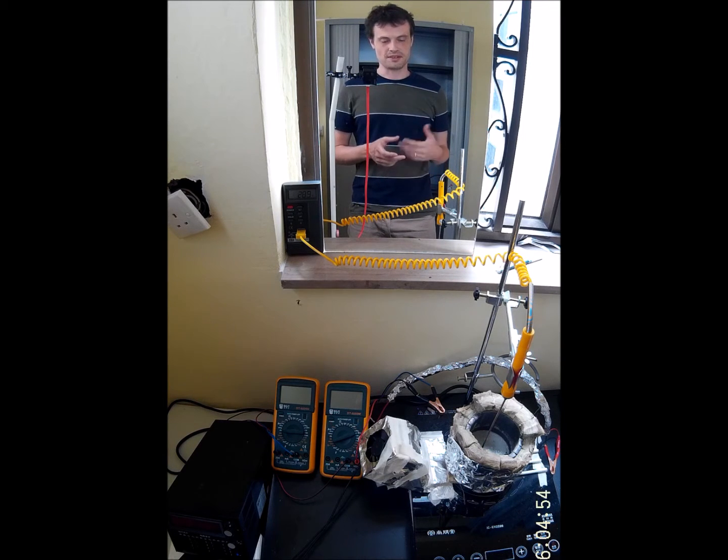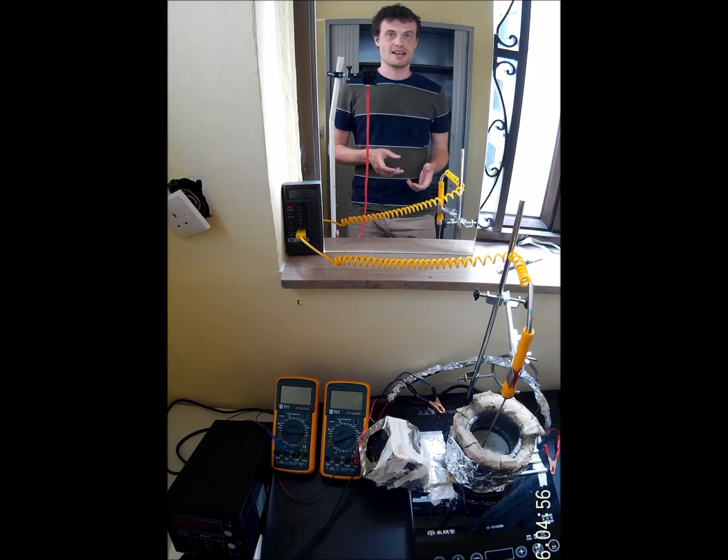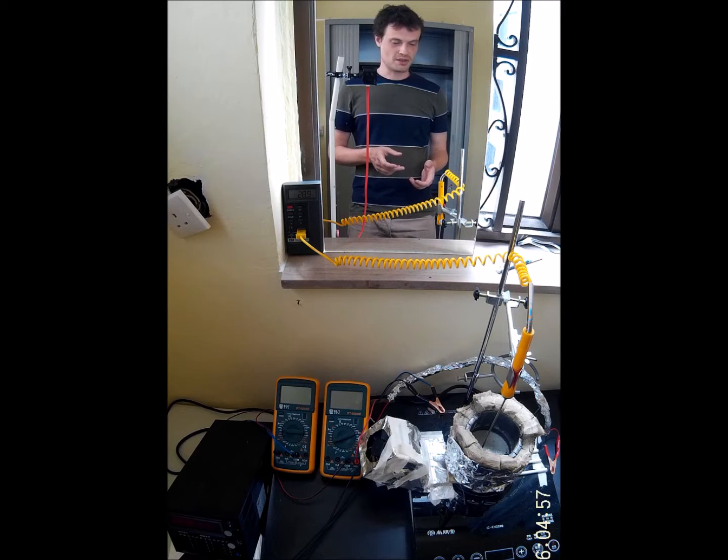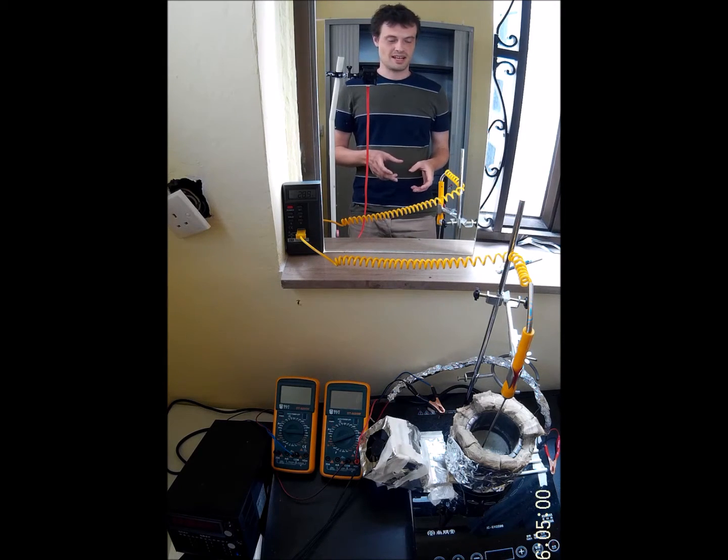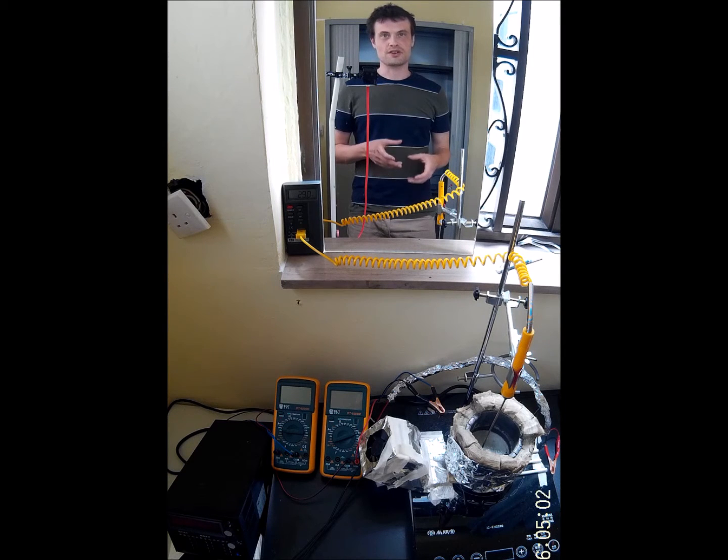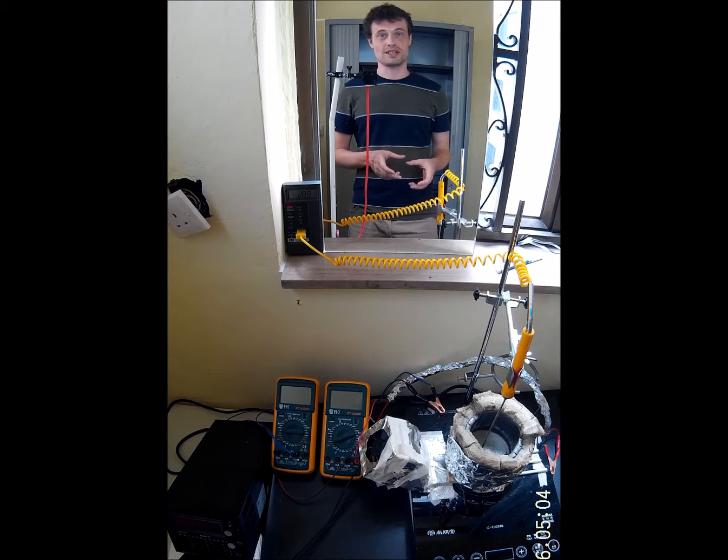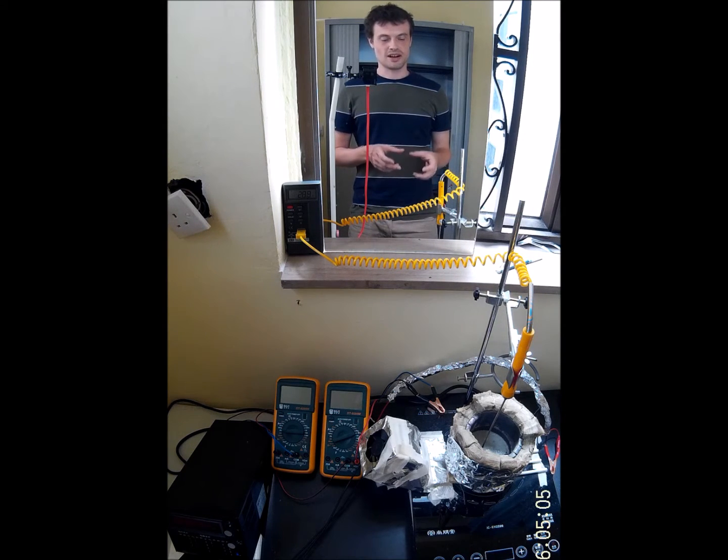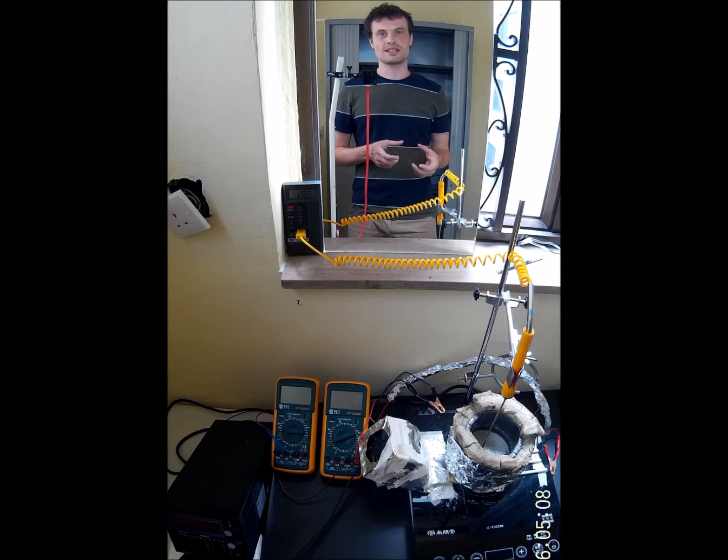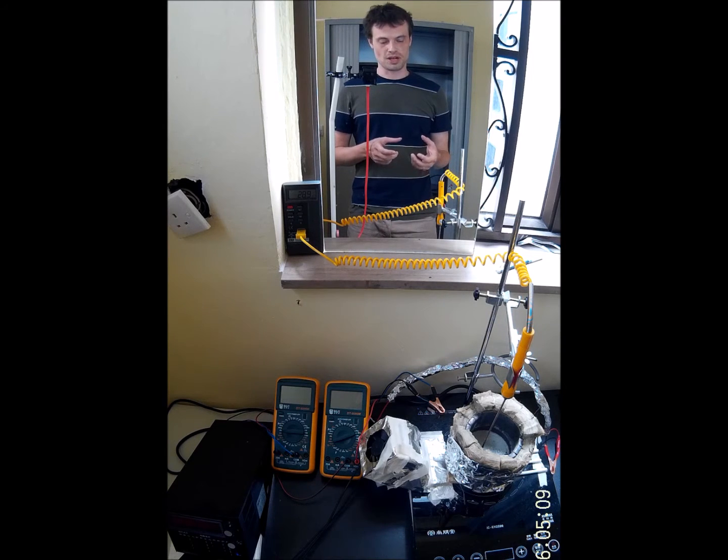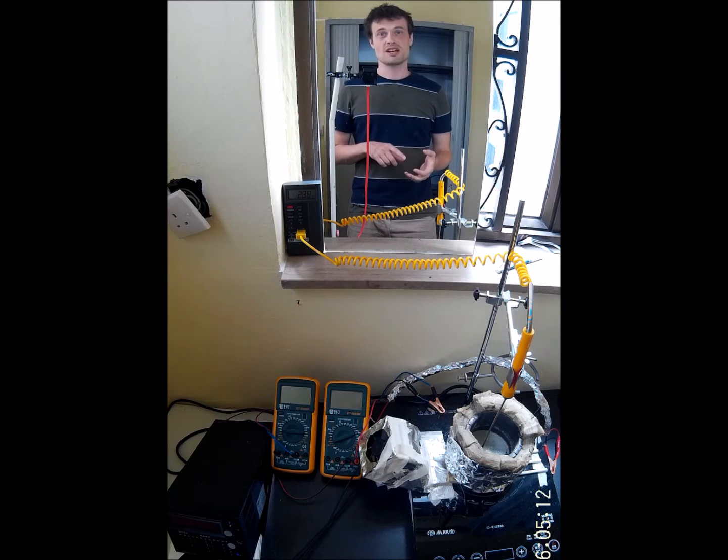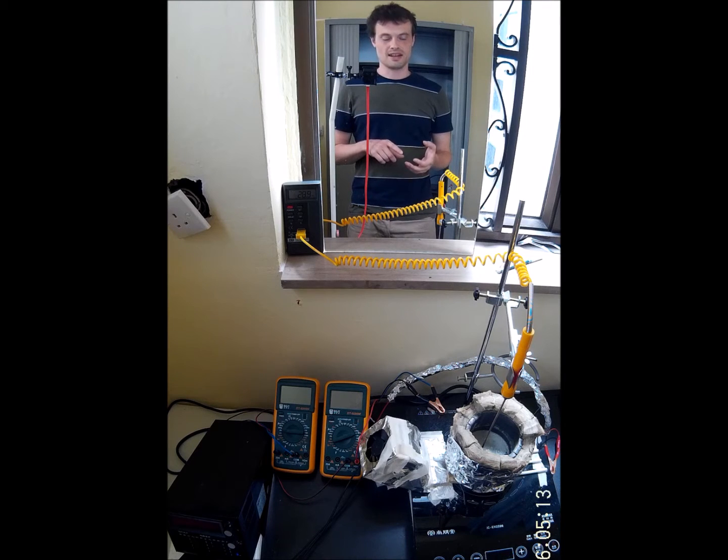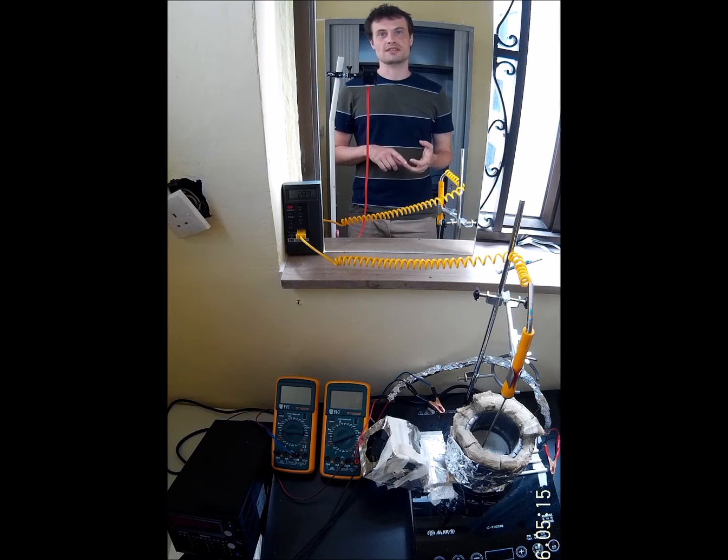The theory goes more or less like this. You have molten lithium carbonate and you drive some current through it. The current will separate lithium carbonate into carbon, oxygen, and then lithium oxide.